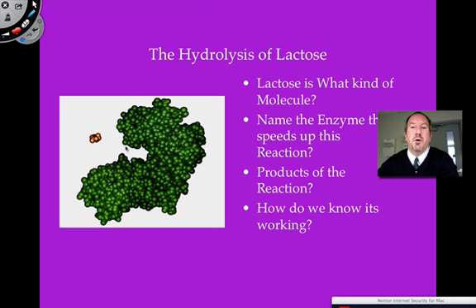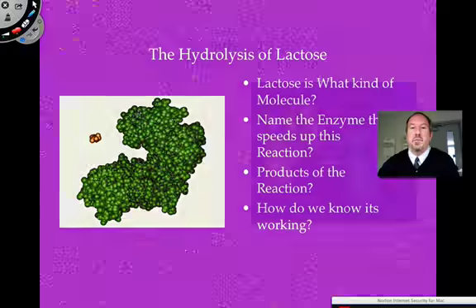And so where I'm going with this is that some bacteria, you know how people are lactose intolerant, meaning they don't produce the enzyme lactase. Some bacteria are humorously lactose intolerant as well. In other words, they don't possess the gene for lactase. And so they're what you would say lac minus. And so this is something of consideration. If a bacteria is lac minus, we could actually give them the gene for making lactase and make them lac positive. It's like, okay, that's interesting.